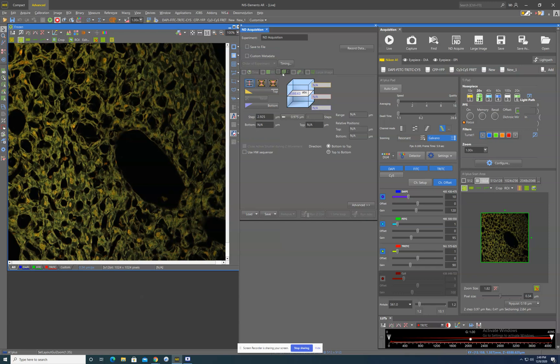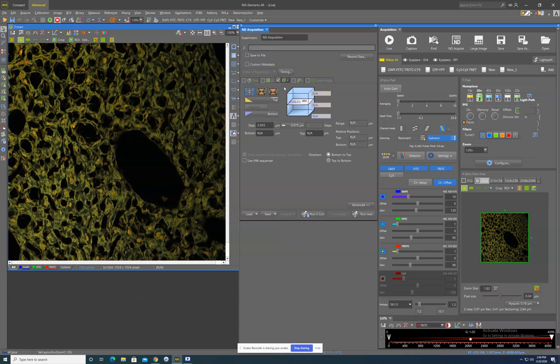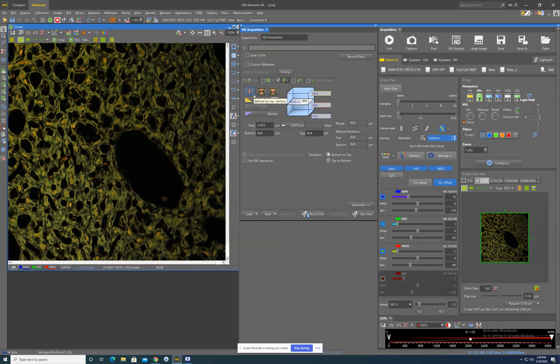So to set up the ZStack, we want to make sure that the box is checked and we need to now define what we want the system to image. So there are three ways we can image this. We often default to this blue one. The blue one is you define the top range and you define the bottom range and it will image in between the range that you define.